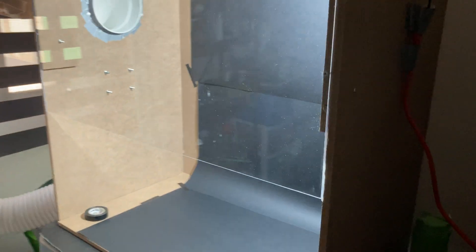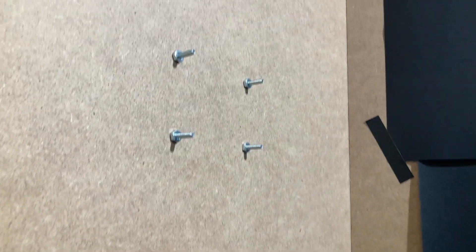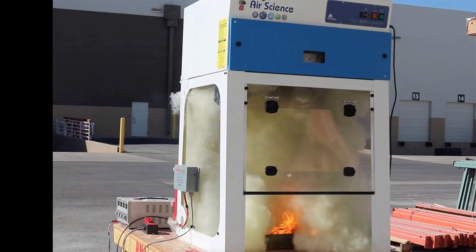For the ventilation system, I use an axial fan, which effectively pulls the fumes out and away from the workspace. It has a capacity of 9 cubic meters per minute, meaning every minute the fan can remove 9 cubic meters of air from the fume hood — that is 3 times the entire volume of my apparatus.